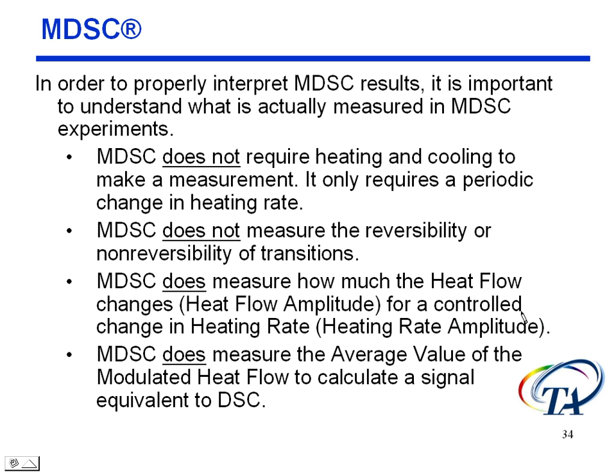Now, in order to properly interpret modulated DSC results, it's important to understand what we're measuring in modulated DSC. Modulated DSC does not require heating and cooling to make a measurement. It does require a periodic change in the heating rate. That's all it requires. Now, we're doing this in a sinusoidal manner, but you could do it in several different ways. But that's what we've done.